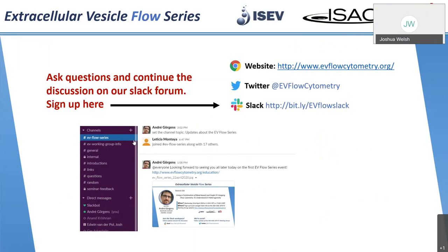So Joanna asked, how does the affinity play into possible competitive binding and steric hindrance preventing binding of some antibodies? Yeah, I think that's a very good question. To give a short answer, we haven't looked into that at all. But you have to consider it.